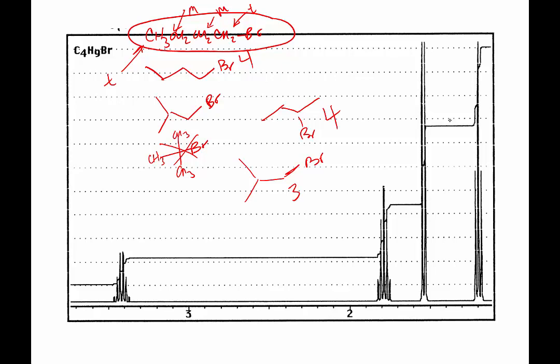So 2, and probably 2, 2, 3, 3 in terms of blocks. So divide through by 2 and go back to 1, 1, 1.5, 1.5, multiply by 2, 2, 2, 3, 3. So this is a CH2 group. That's a CH2 group. Except it's not.